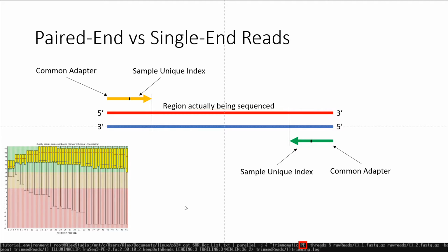I have this here to show how paired end reads can be more beneficial than single end reads, but this is just a single end depiction. For single end reads, sometimes you'll see the quality at the very end drops down really far, so the end of the read can have bad quality, which kind of stinks. Paired end reads generally have a little bit better quality. It's good for transcriptome work, and when you need high read counts. It's also really good for looking in those transcripts for novel splicing variants and also some insertions and deletions. Paired end reads, with the increase in quality, are also really beneficial for some genomes. If you're trying to do a de novo assembly of genomes and you don't have that template or the reference genome, paired end can give you higher quality for that as well.